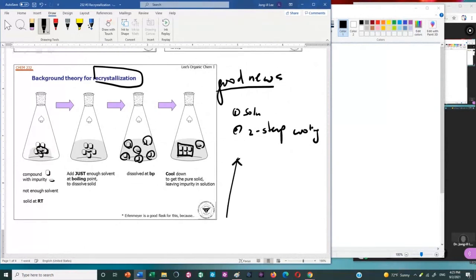We chose the solvent so that the impurity has good solubility, like compound B in one of the slides from our speakers today. Even at low temperature, at the boiling point, the solubility is good. What if it's not good all the time? We remove the insoluble impurity through what process?